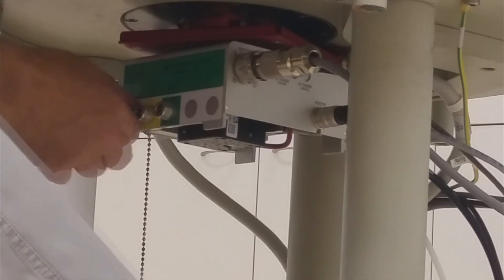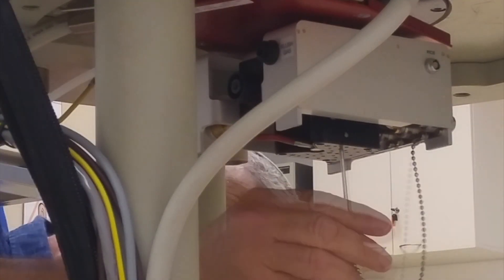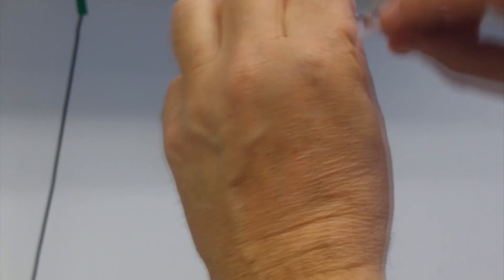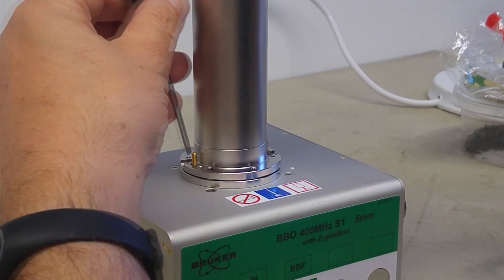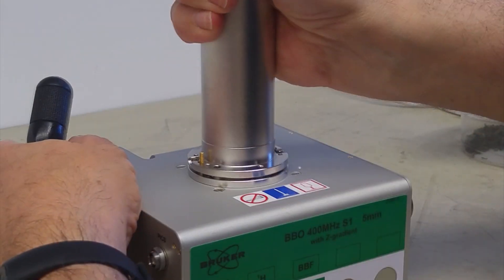The next stage is removing the probe — disconnecting the RF cables, gradients, thermocouple, heater, and air connections before taking it away for cleaning. The probe head contains many fragile parts that are extremely costly and time-consuming to repair, so we need to take the utmost care. I used gloves to prevent contamination of the probe with finger grease.